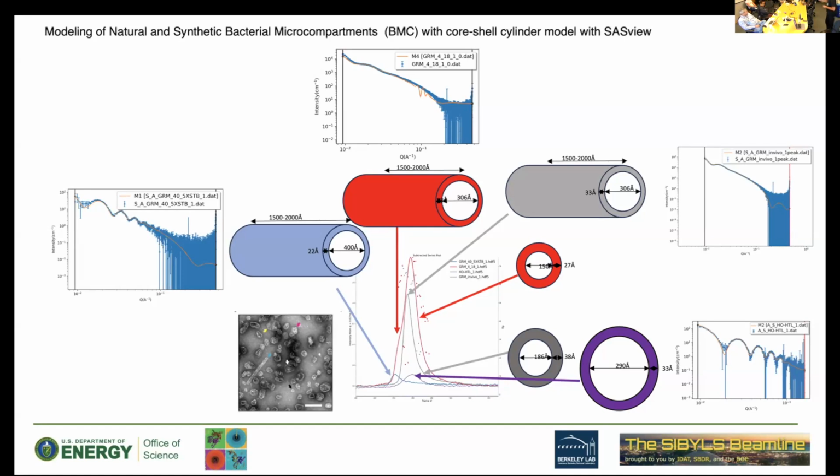Thank you. So with AlphaFold 3, I've observed some mixed results with its ability to predict oligomers. In some cases, it actually does quite well, but in some other runs I've tried, it makes really weird predictions for some oligomers. I say that based on comparison to some SAXS profiles that have indications for those oligomers. So I was wondering if there's any discussion about implementing experimental SAXS curves with AlphaFold to improve the robustness of predicting oligomers.